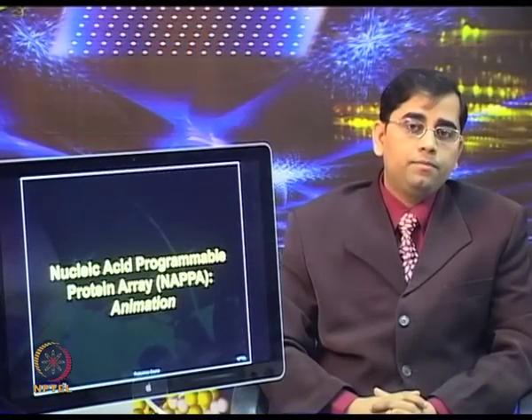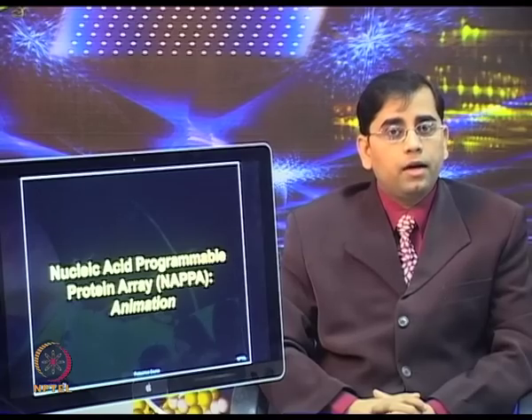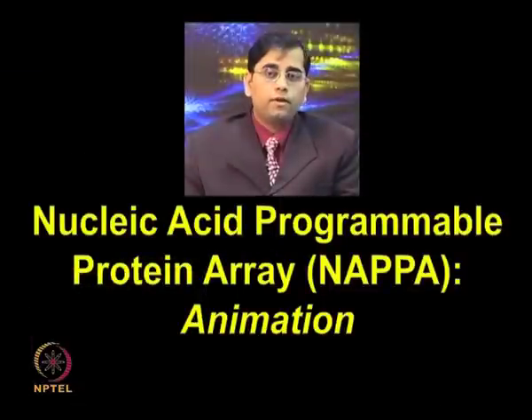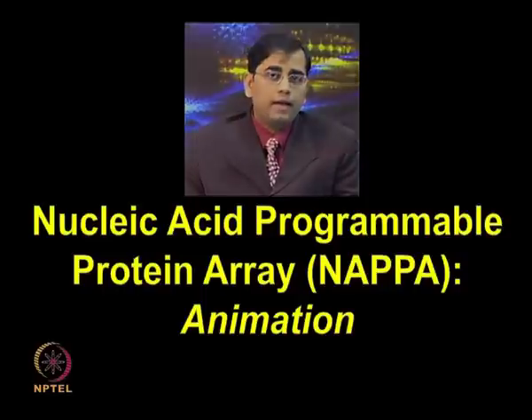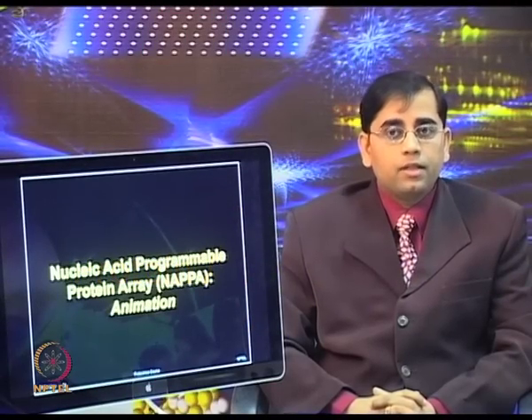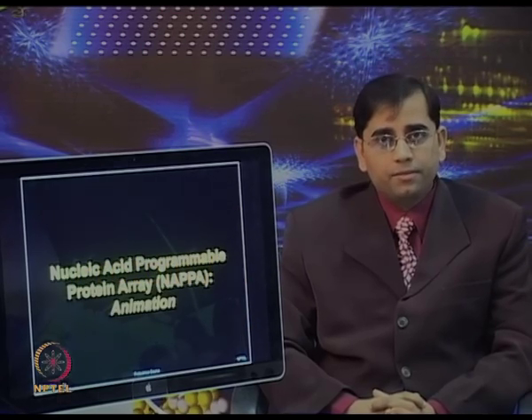So, the NAPPA method provides various applications similar to other protein arrays, including detection of interactions with proteins, nucleic acids, lipids, small molecules, antibodies and enzymes. So, let us now discuss the working principle of NAPPA in this animation.